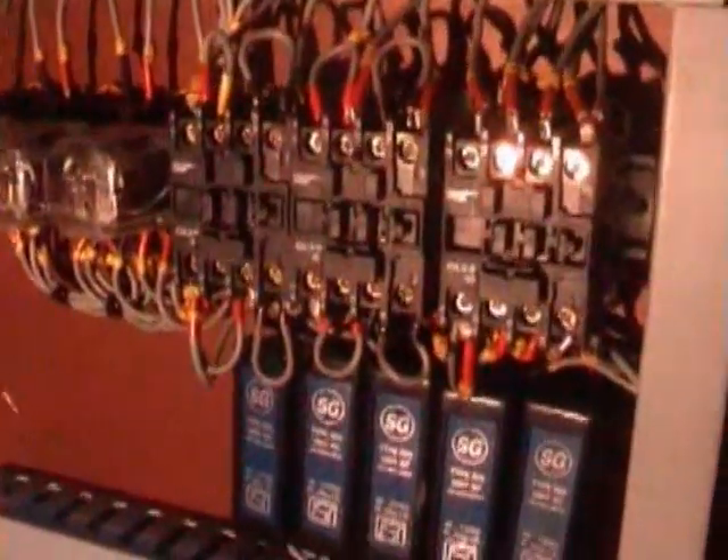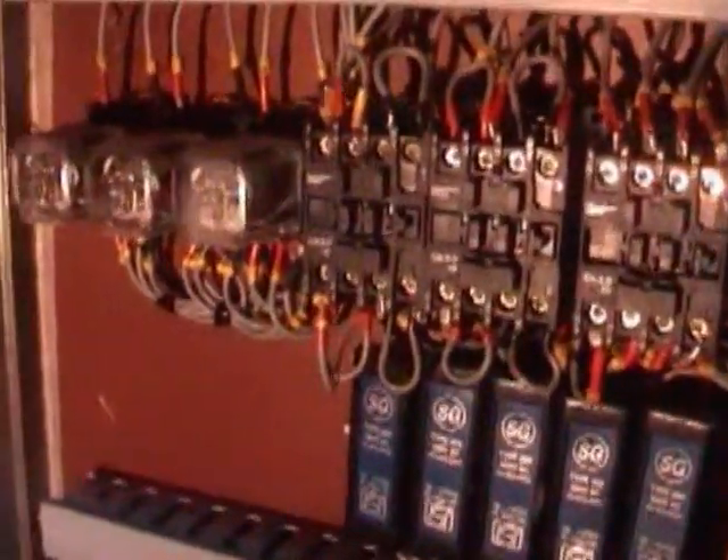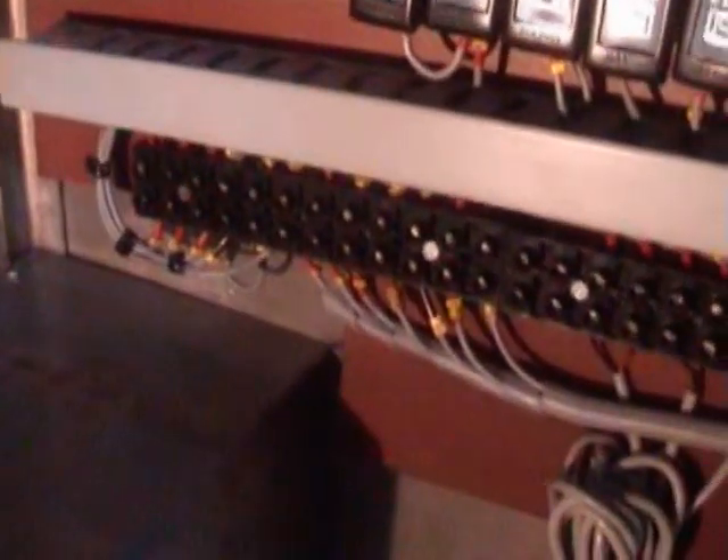This is the panel of the machine. You can see everything is serially numbered so that during maintenance you can easily identify which wires are for which application. Simultaneously we also provide the wiring diagram for your perusal.